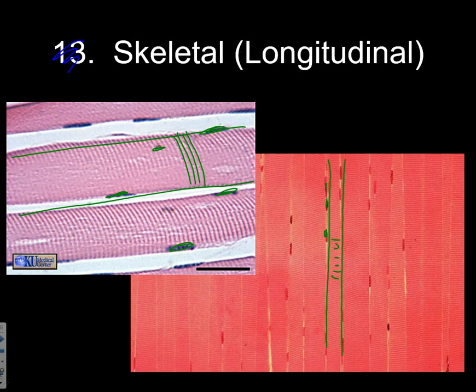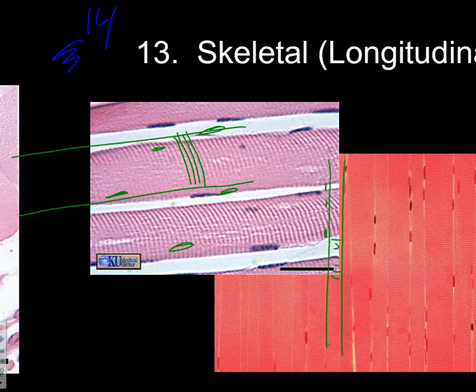All right, here, once again, clearly can make out the striations. So it's either cardiac or skeletal. These cells are long and straight. And we can see here they have multiple nuclei pushed out to the edges of the cells because they're packed up with, these ones are running this way, striations are going this way. And there's the nuclei. So definitely skeletal muscle, which would be slide 14. Long, multinucleate striations, not branching.